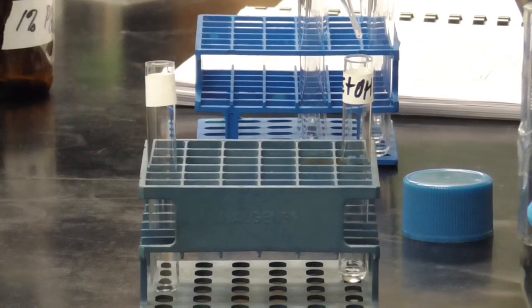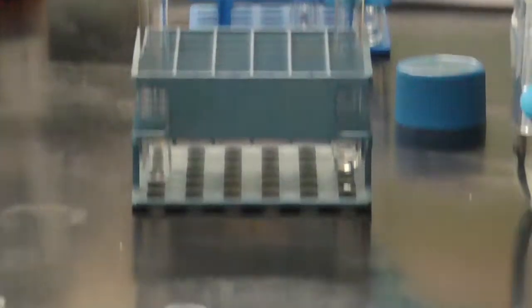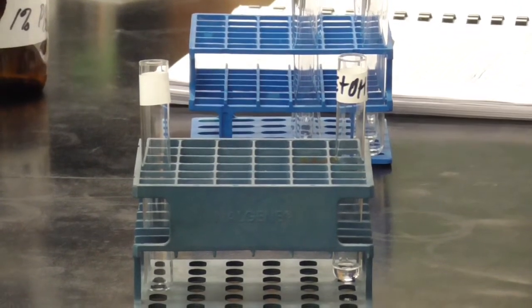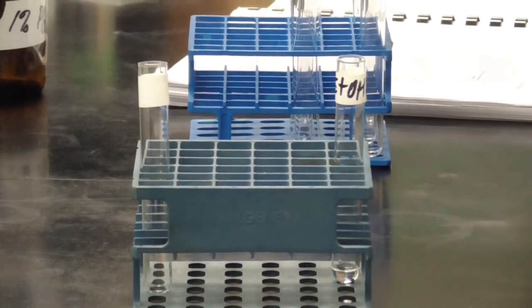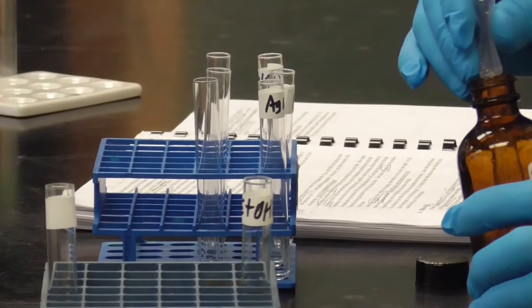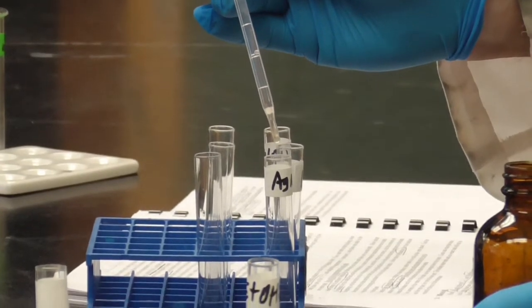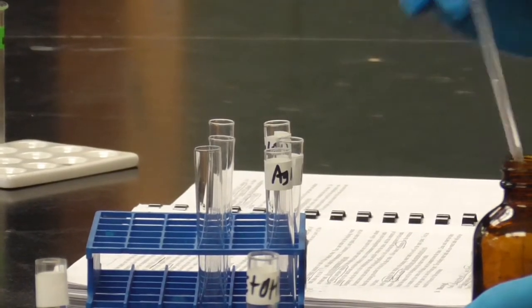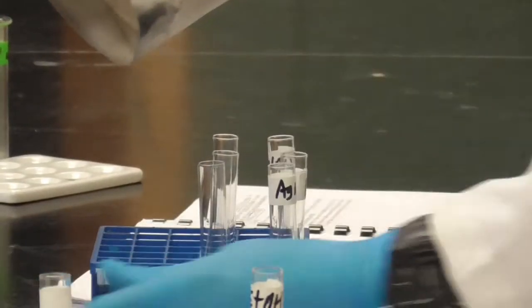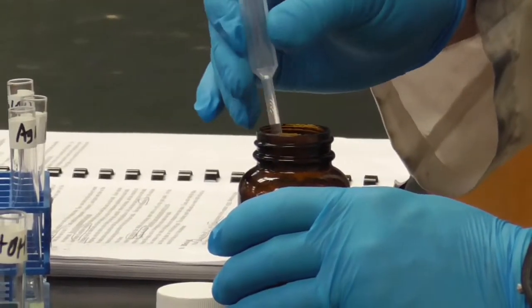Okay, our silver nitrate. Mercury chloride, actually.